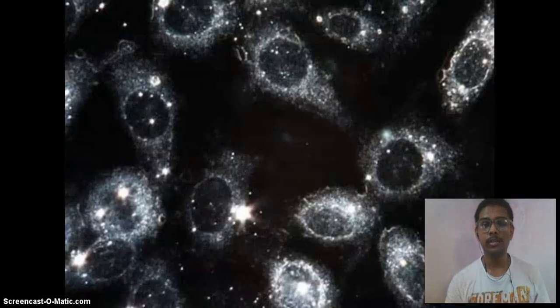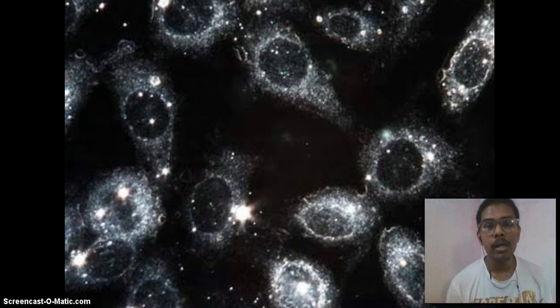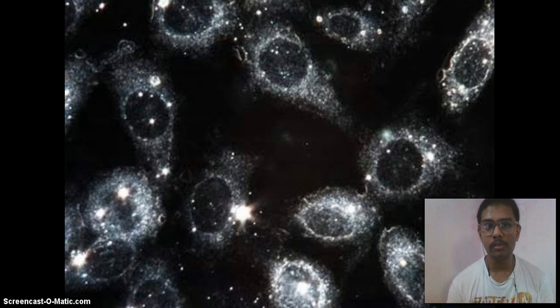Now, in one dark field image in particular, you can see this type of image where all the background is dark, but the cells are very bright and shiny, and that's why you can get any small details of your specimen. Okay, and now in a minute we will see a very short video which will help us understand the whole concept in intricate detail.